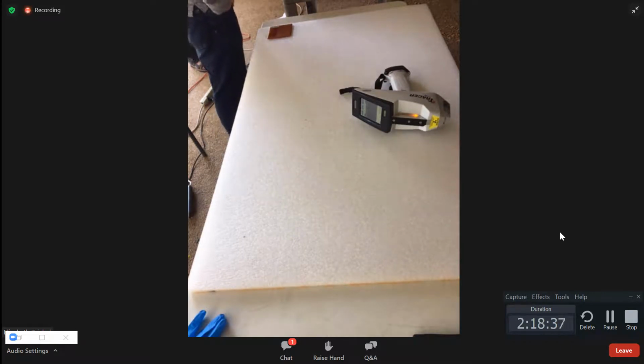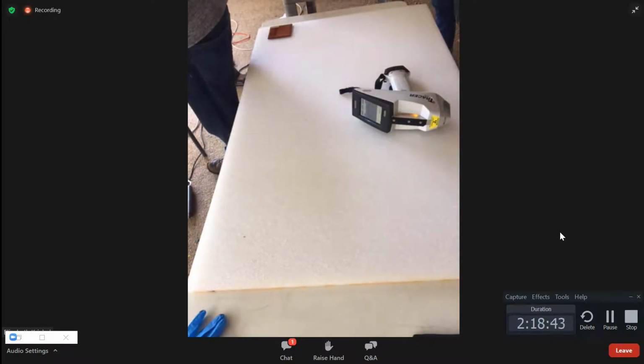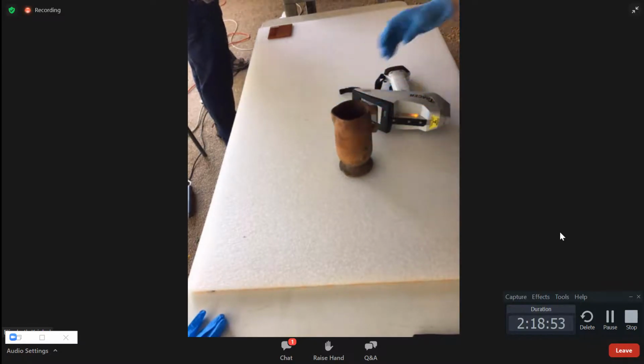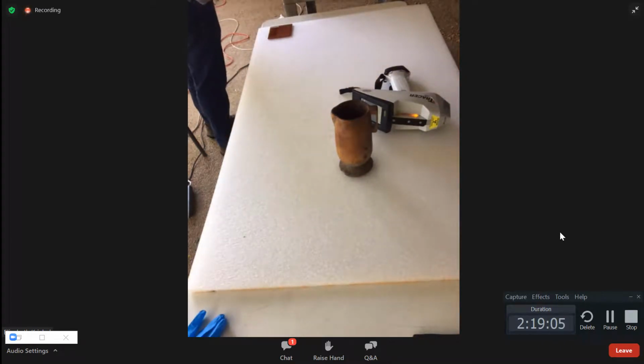What's next? Is there any particular priority? As you saw the rest, we've got a few things to do in the lab. But I think this is almost the end of the line. We've got these moccasins, these baskets, and then there's a moldy leather bag in here. I want to test it for arsenic. We had a couple of pots prepared with wires, and I want to see if they were bad. I think they might be on the exhibit, so I'm going to go look. But I think there are 3 things we can only do in the lab because they're either fragile or faulty. Well, what we can do then is I could go down there individually and just do them. And that way we've got a reconciliation between coronavirus safety and being done.